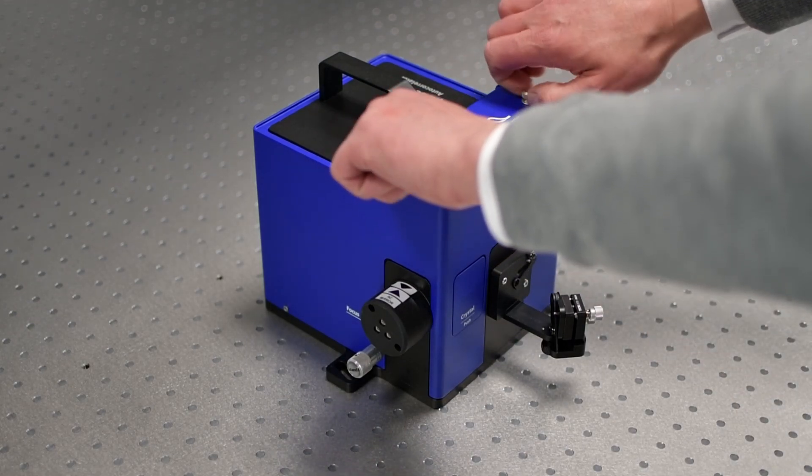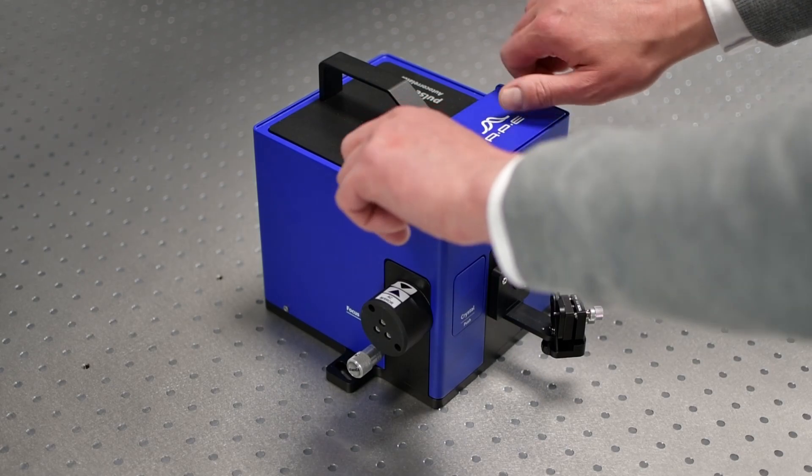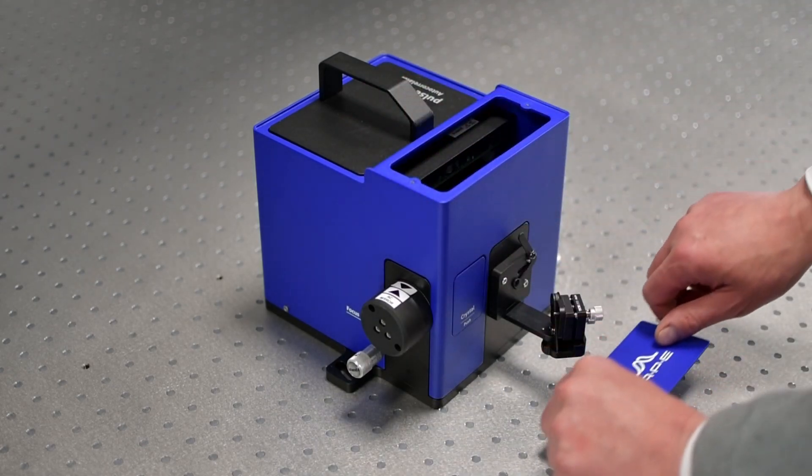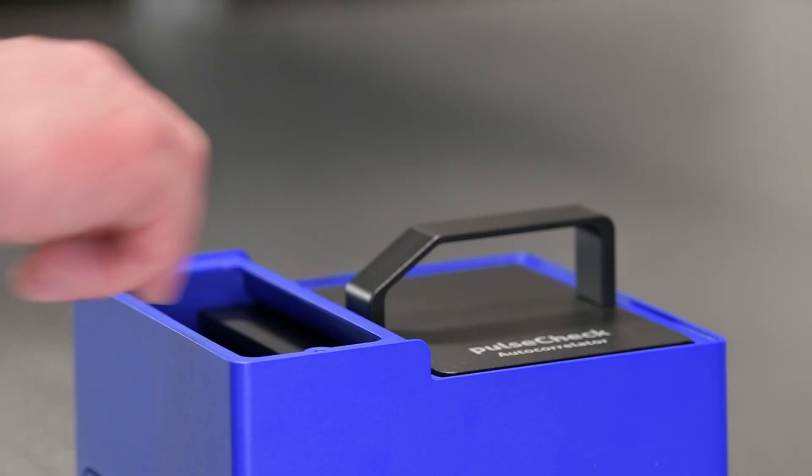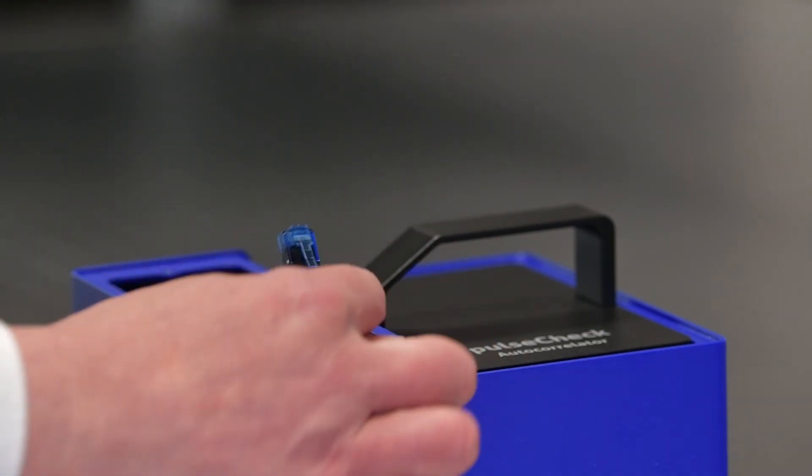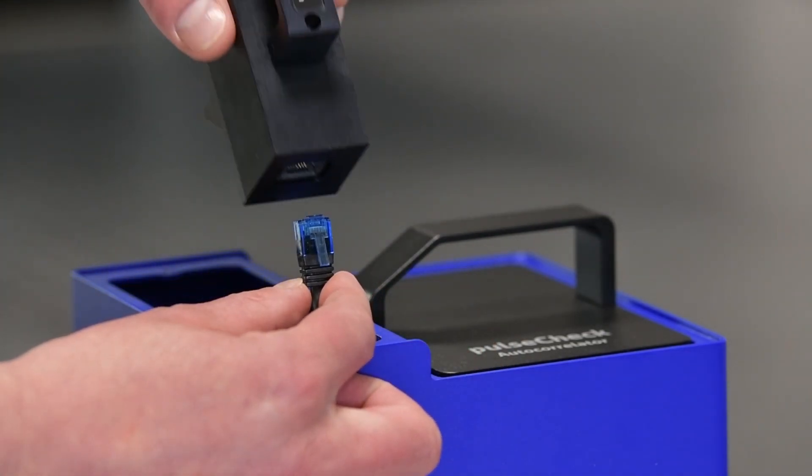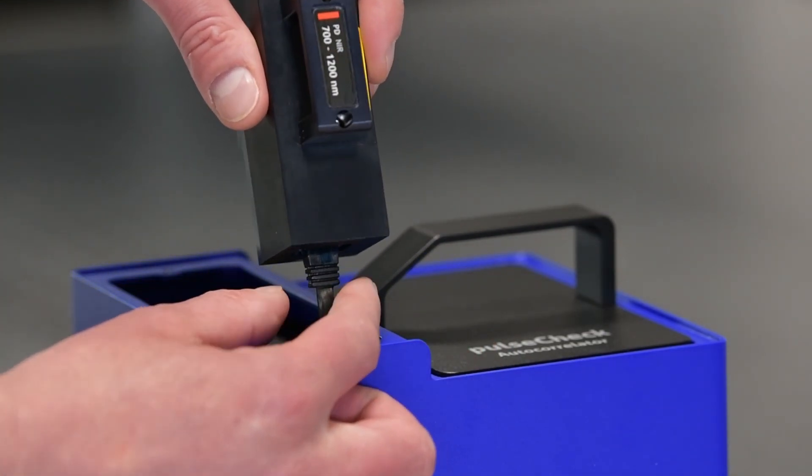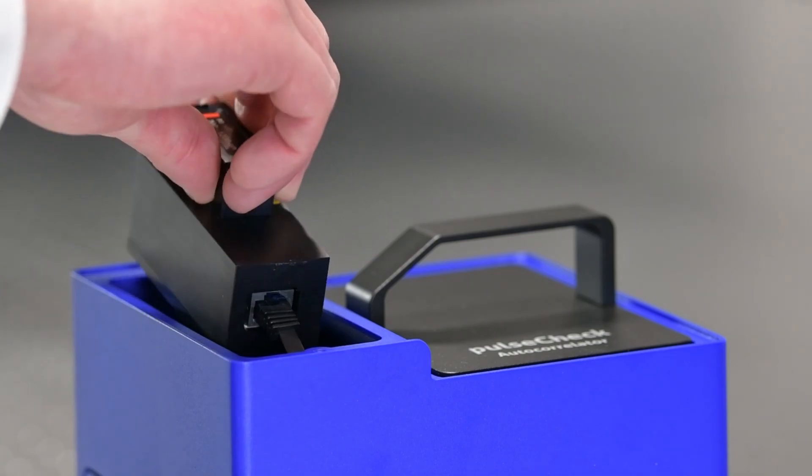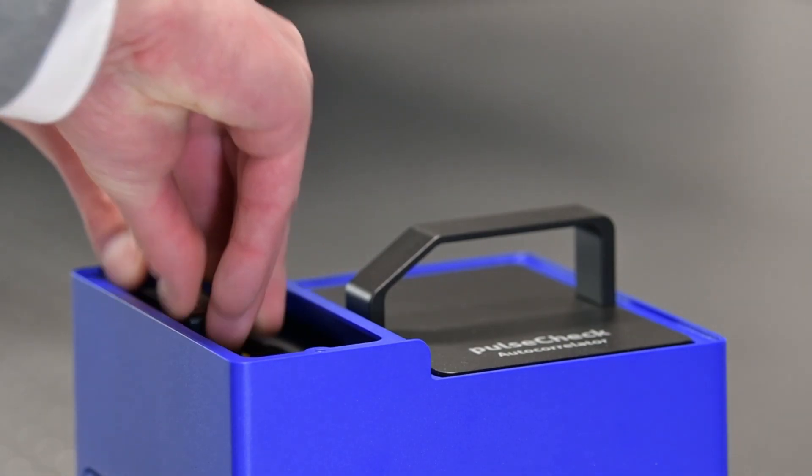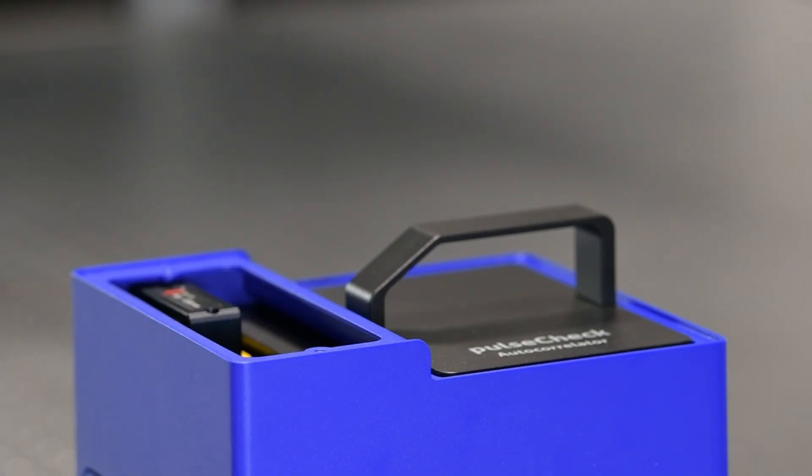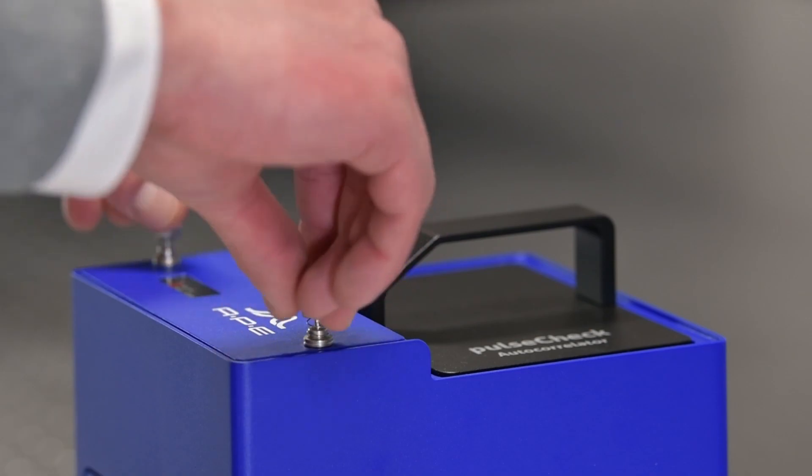To install the detector, remove the top lid. Connect the detector cable to the detector and lower it into its mount. You will hear a click sound when the detector slides into the correct position and the magnet snaps in. Then close the top lid.